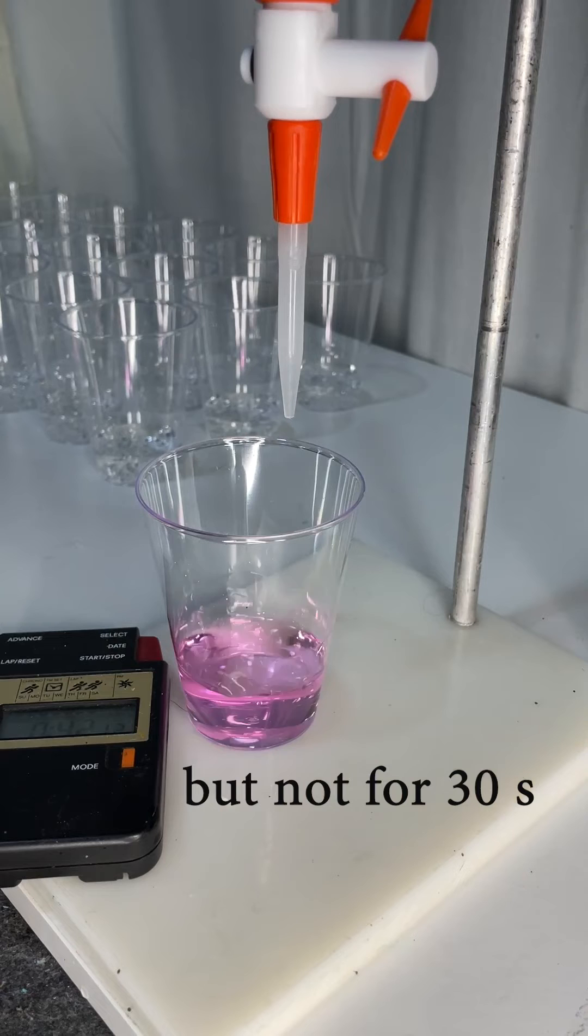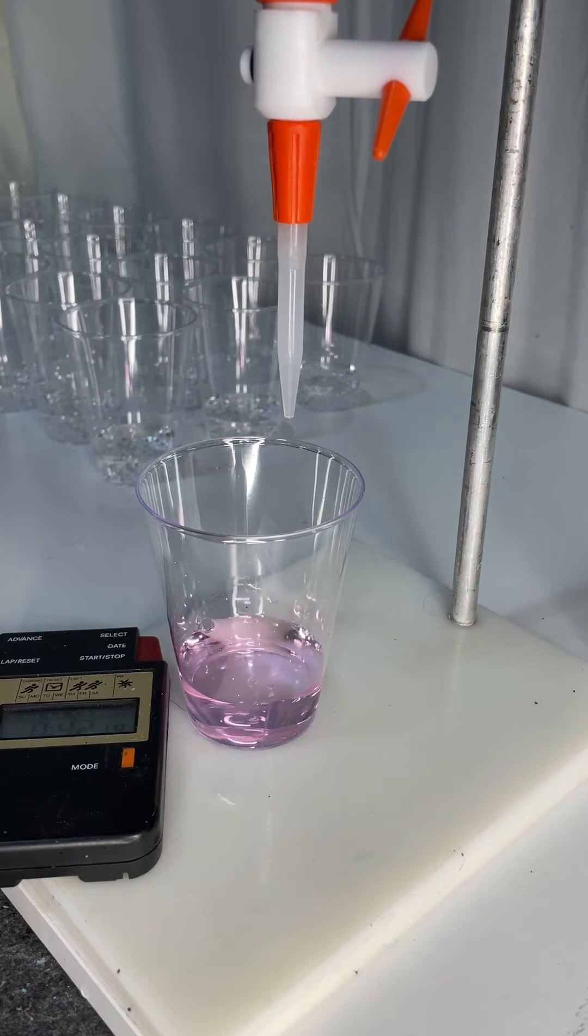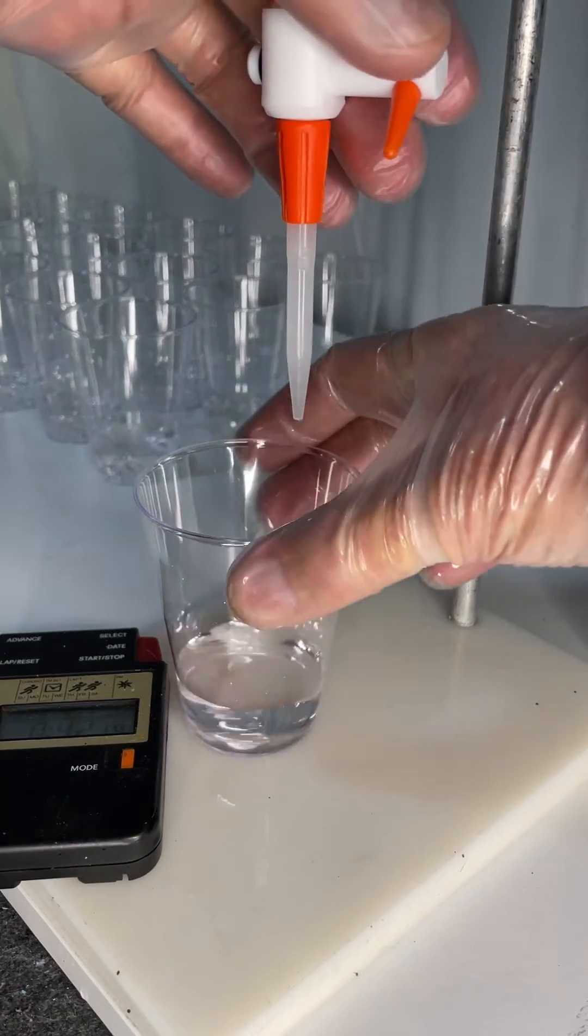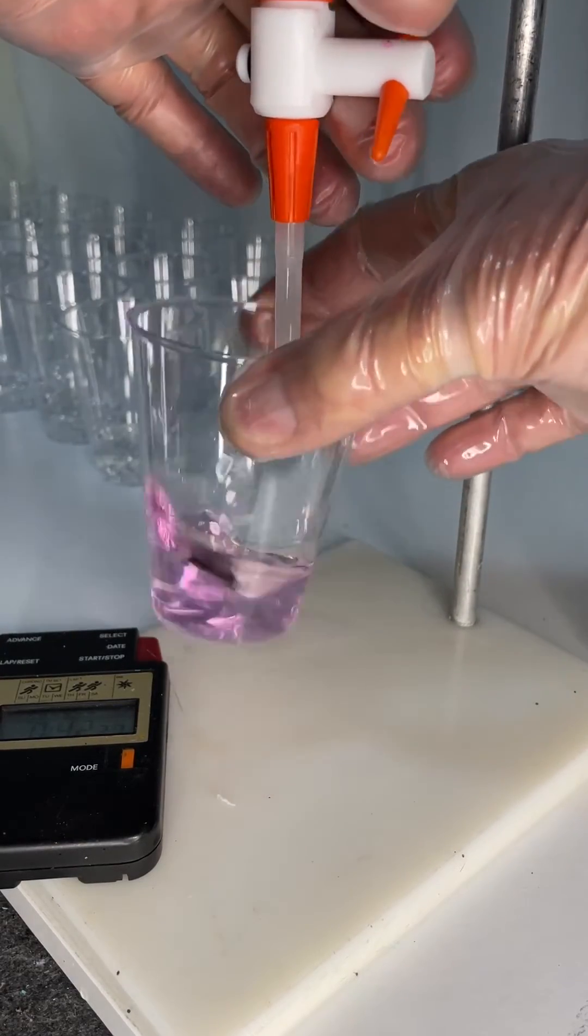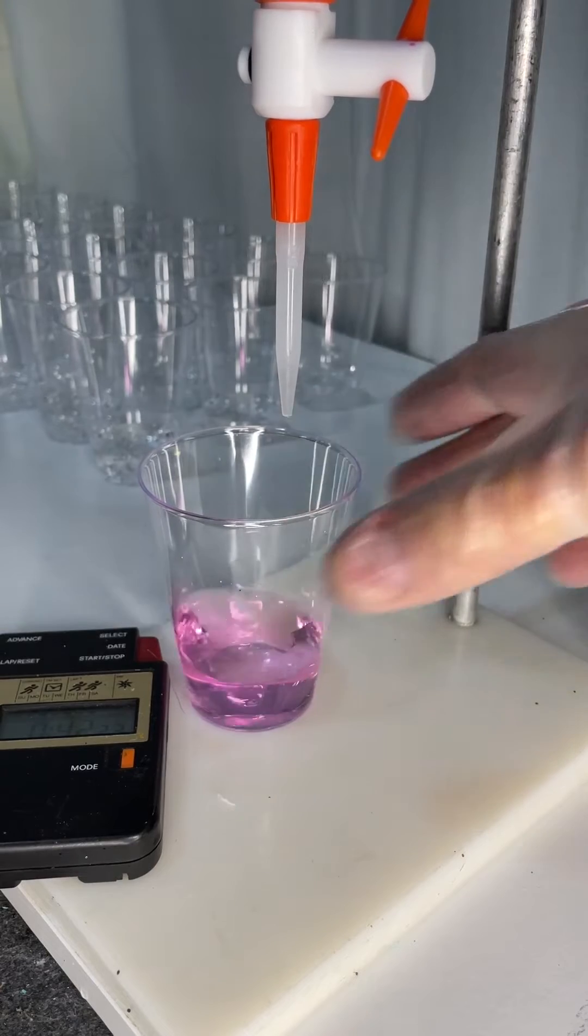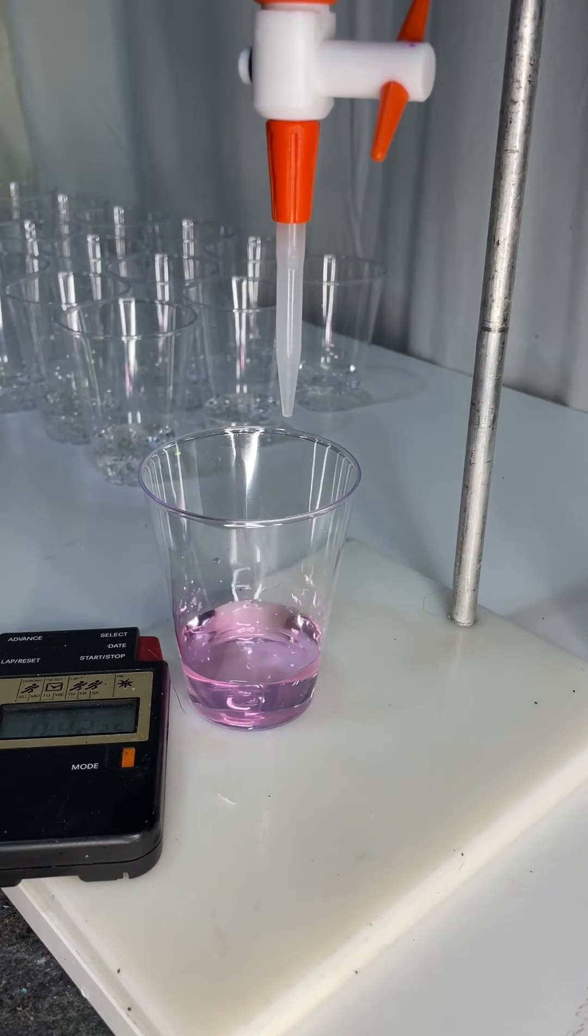So I've added a little bit more, another drop, and it's lasting maybe five seconds until it goes clear. The pink color's gone so I just keep adding sodium hydroxide until I get that faint pink lasting 30 seconds.